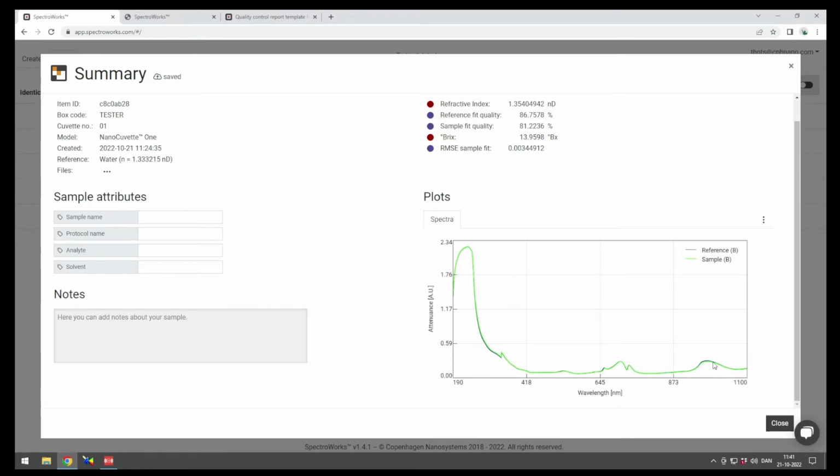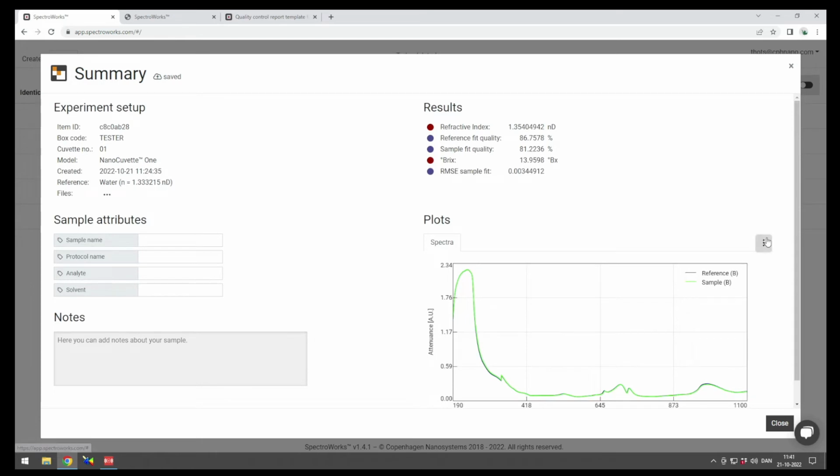And here you can see wherever you see dark areas, that's where there is a small shift, and these are the things that we are tracking, right? You can also save it as an image and append it to a quality report, or you can export it to a CSV file and import it to whatever data platform that you use.